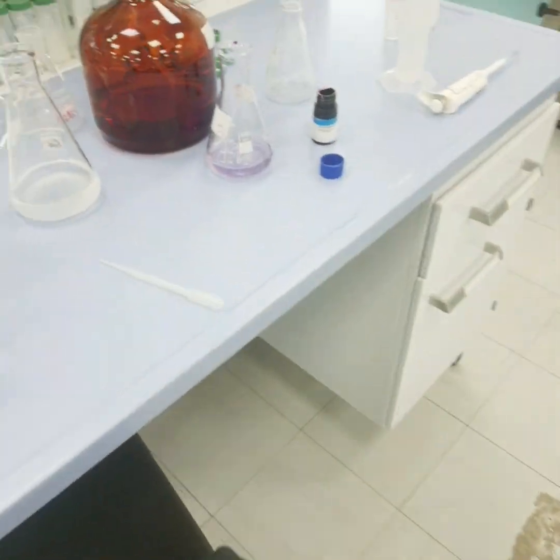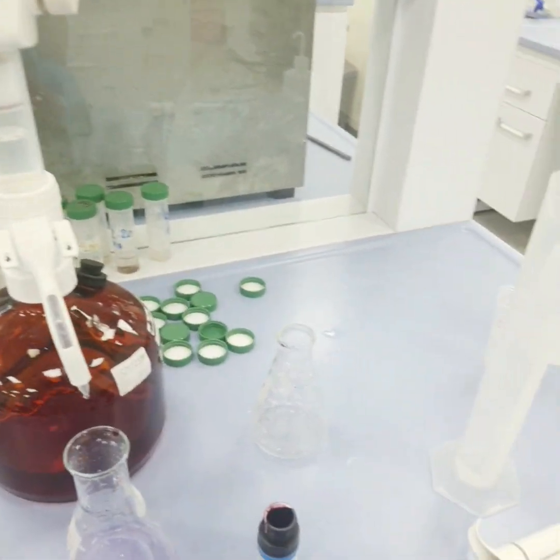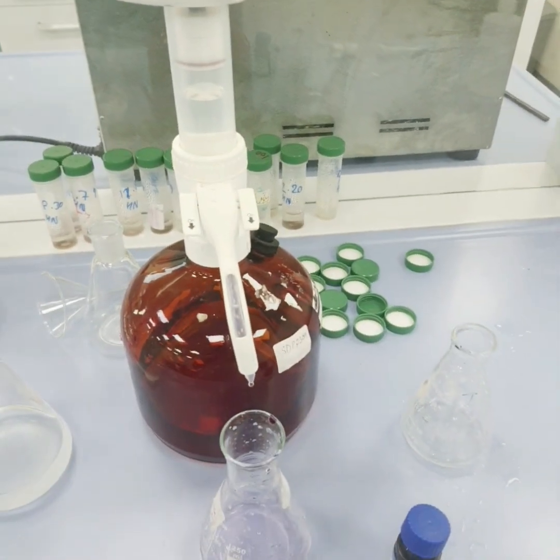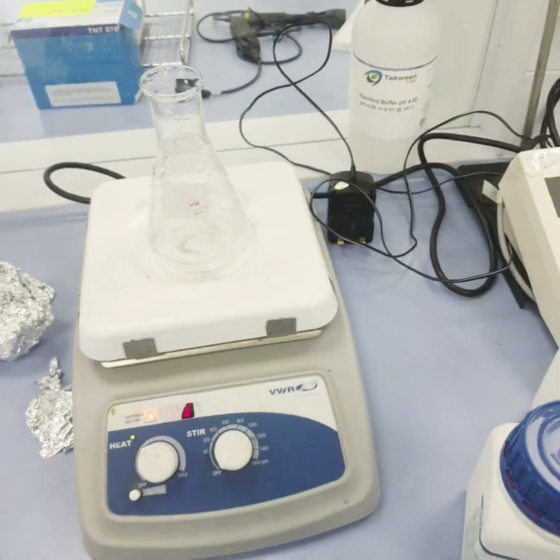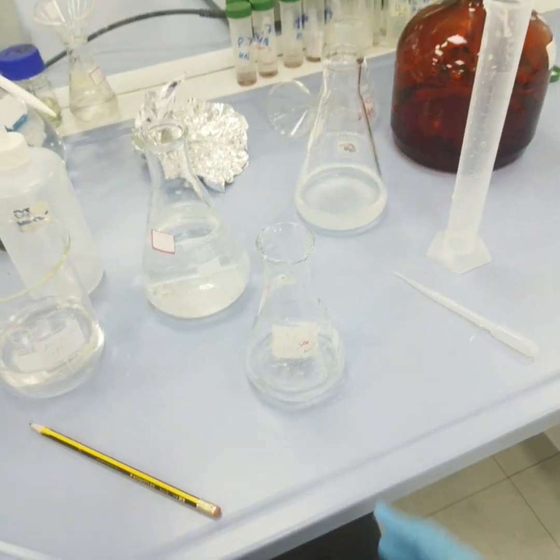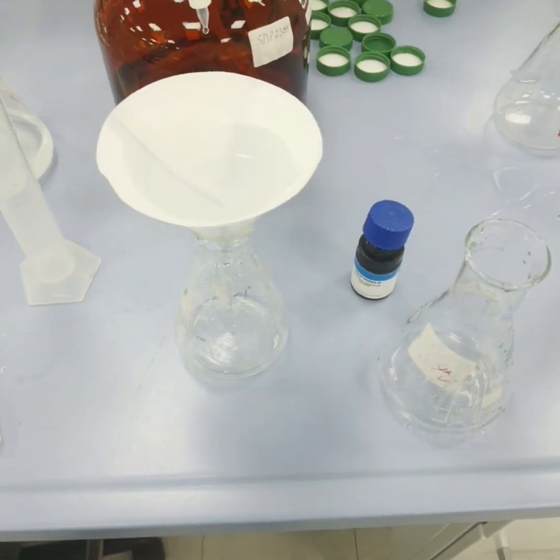We would take around 100 ml of the water sample and then we will boil it so that the temporary hardness is removed, since we found total hardness earlier. Now I will boil it till it is half. After boiling, what we need to do is to filter it. Now we are filtering it.